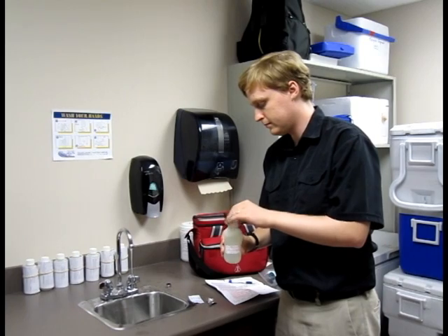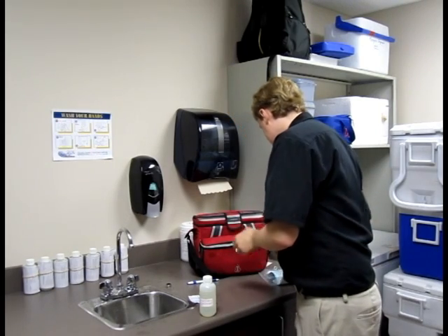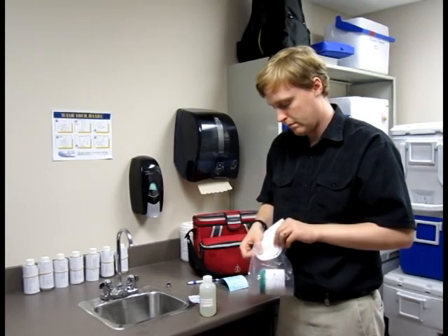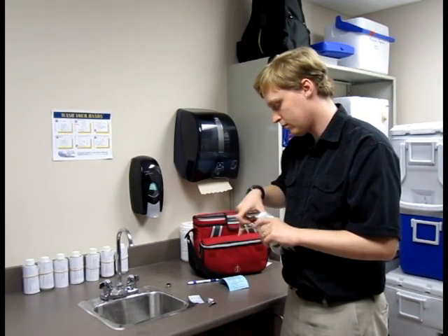Package the paperwork and the bottle together. Place the sample in an insulated cooler with an ice pack until it reaches the lab.